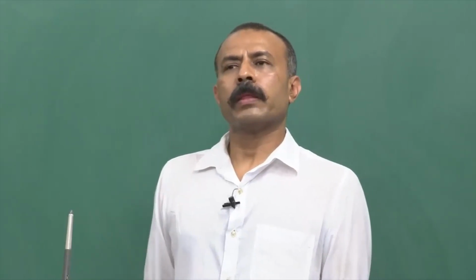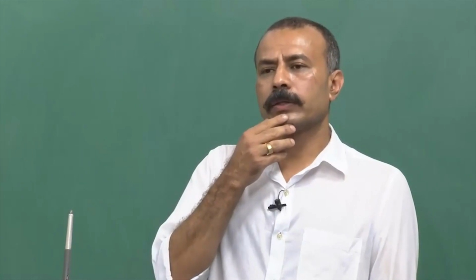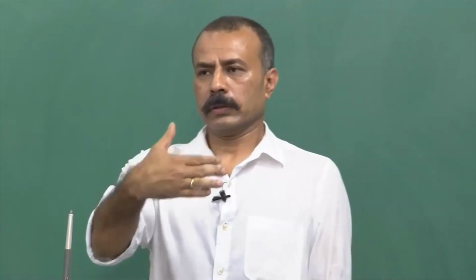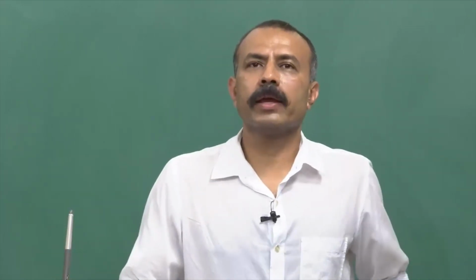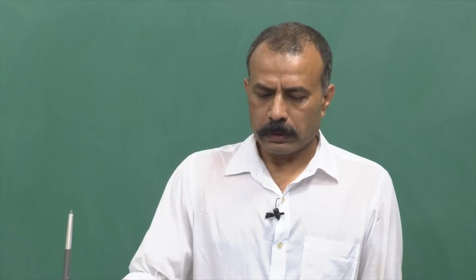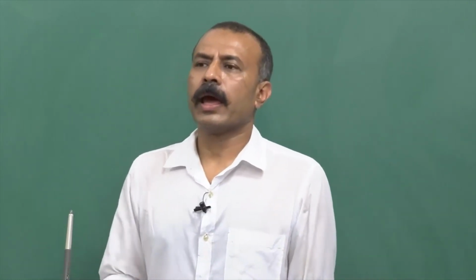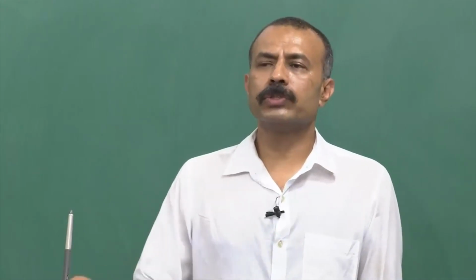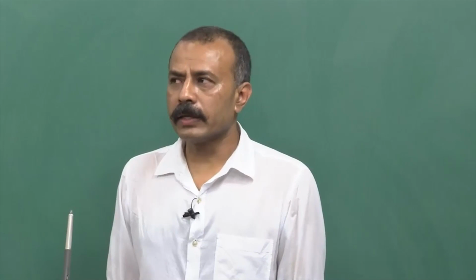So, last week if you remember, we talked about the first level, how we can create a system for adult neuronal culture. So, in week 6, we will continue with that and the different issues, different challenges and what all modern techniques we can use.